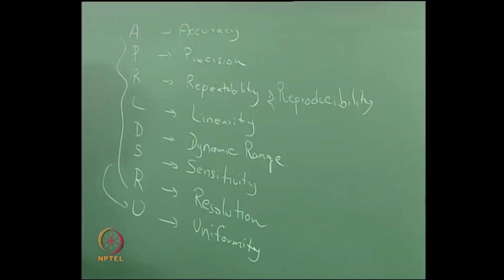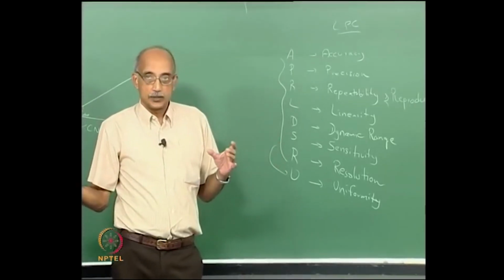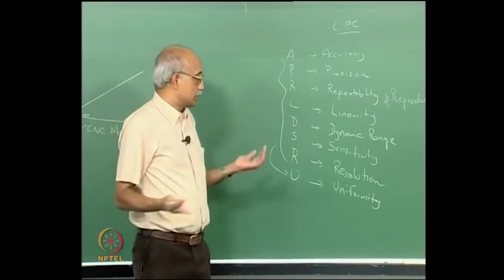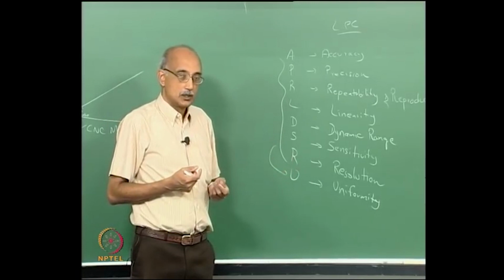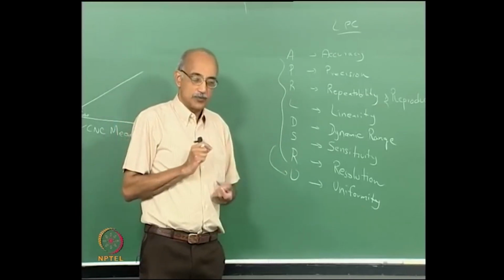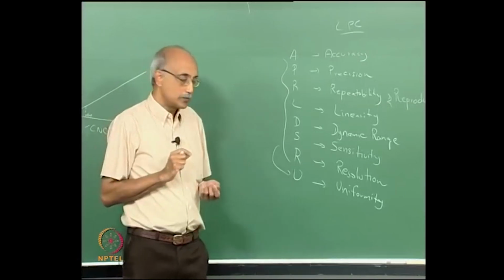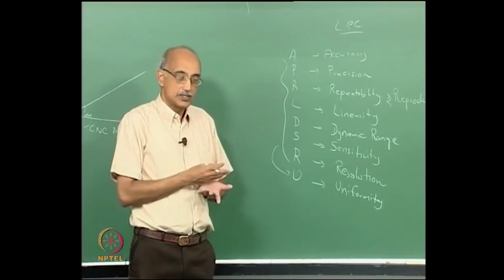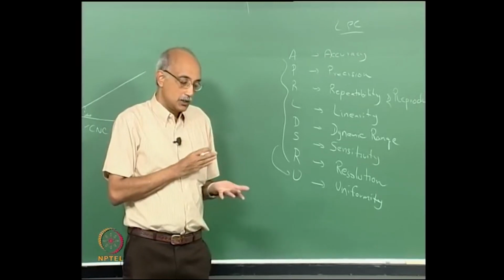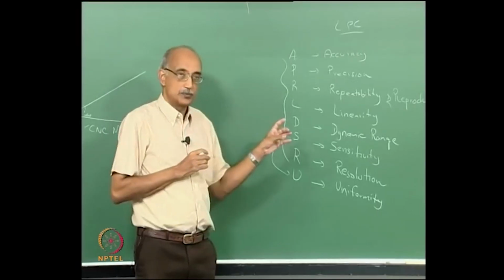Then what you would do is take the readings that you get from your instrument, compare them to the readings that you get from the gold standard, and verify that your instrument is calibrated. Now, that becomes a fairly laborious process, and so what people have tried to do is establish what are known as silver standards. A silver standard is an instrument that is based on the same principle as yours.